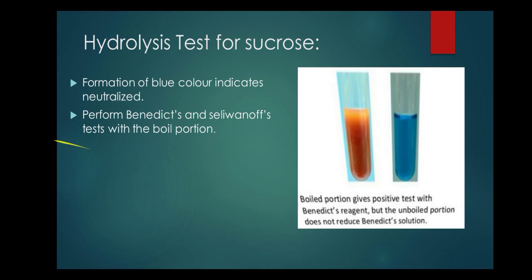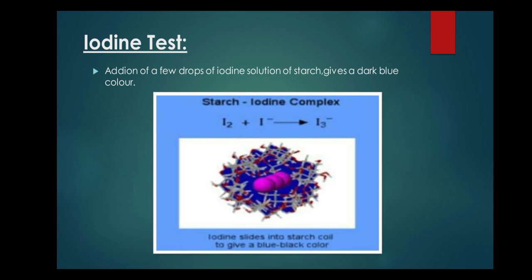Hydrolysis test for sucrose. Formation of blue color indicates neutralization. Perform Benedict and Seliwanoff tests with the boiled portion. The boiled portion gives a positive test with Benedict reagent, but the unboiled portion does not react with Benedict solution.